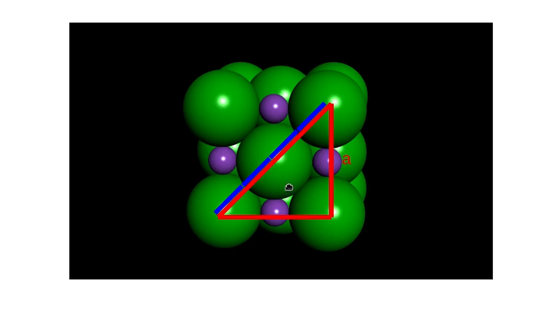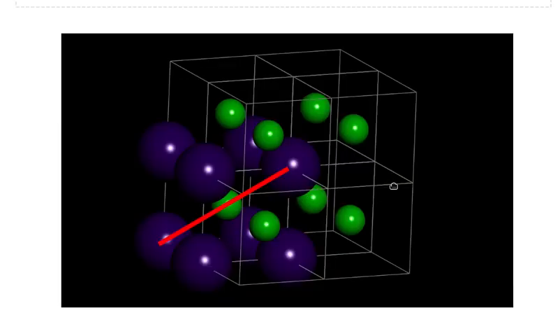Have a look at the manual, and the manual will advise you on how many atoms of each are in the unit cell. With cesium chloride it's slightly different.